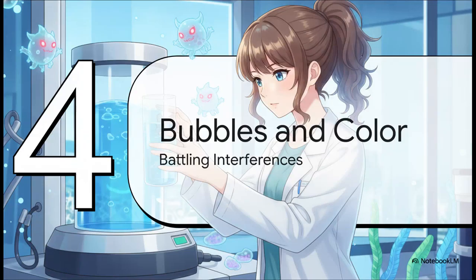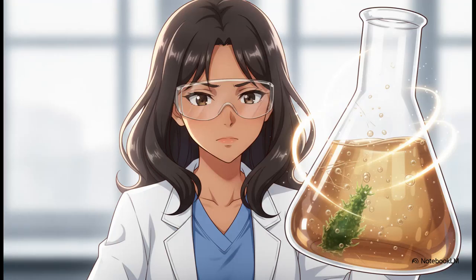All right, Section 4, battling bubbles and color. Operating these machines isn't just pressing a button and walking away. As we see in cinematic lab experiments like Dr. Chem's, technicians are constantly battling microscopic interferences. Anything that scatters or absorbs light artificially is going to create a bias in your final reading.